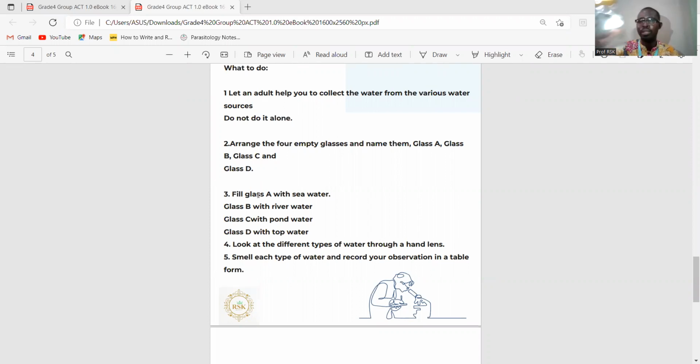All right, so this is our well water. You can see the well water. There are some particles in it. Let's look at the base here. You can see some threads and some dirty things in it running through it.